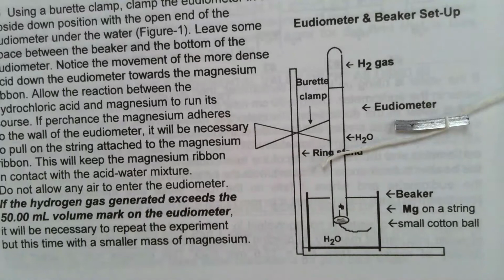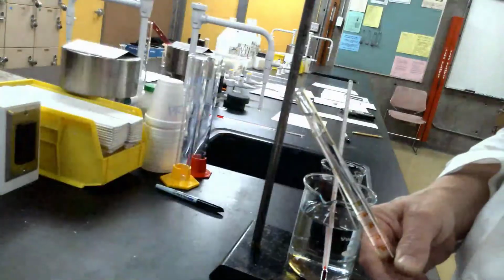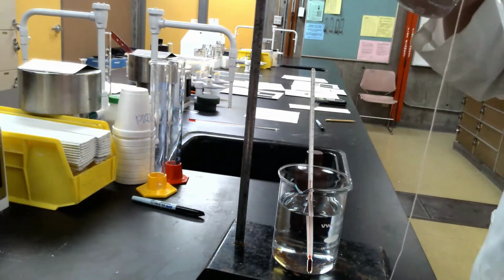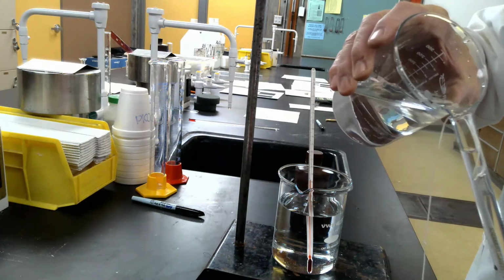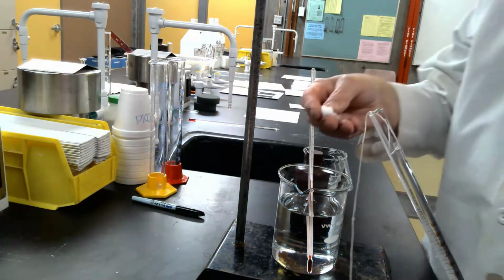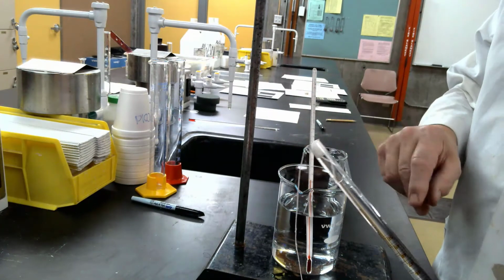Now what we will do is turn this upside down, put about 5 milliliters of 6 molar HCl in there, and then we'll top it up with distilled water. I've got my magnesium ribbon in, maybe 5 centimeters. Now I'm going to top this up with water. Then I'll take a small piece of cotton, moisten it, and push that in there, trying not to get an air bubble in there because I don't want air in there. Notice now everything's ready.